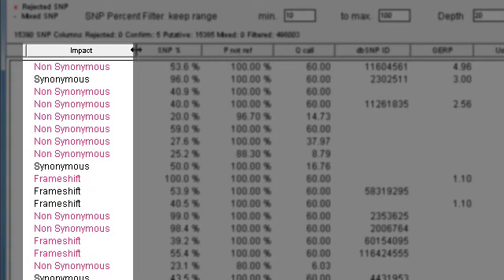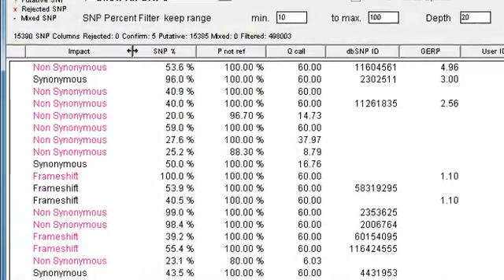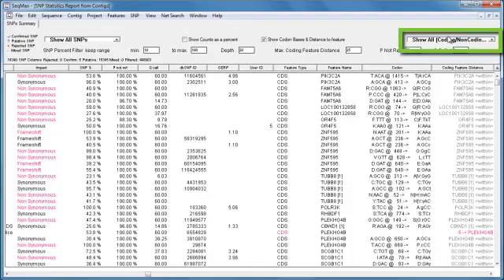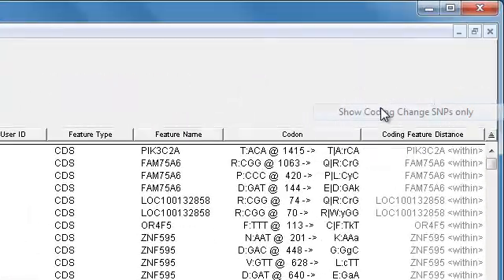Here, coding changes are shown in magenta. If I'm only interested in SNPs that result in a coding change, I can use this dropdown to show coding change SNPs only.